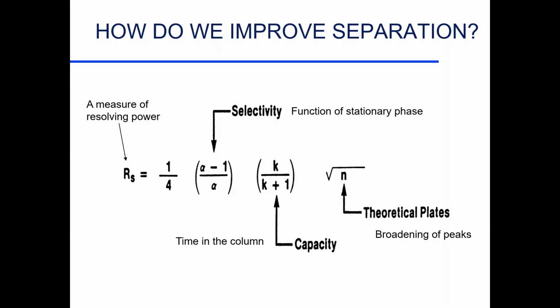And so, again, we look at our stationary phase. We look at the compound itself. Because if a compound is very volatile, it's going to come out very quickly. So, again, how close does it elute? This is the one we work most with.